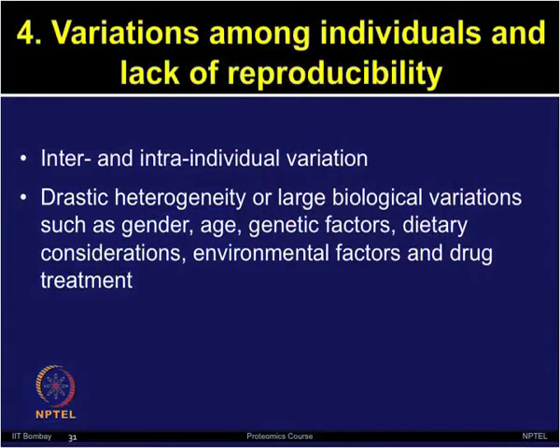So, the drastic heterogeneity or large biological variations such as gender, age, genetic factors, dietary considerations, environmental factors and drug treatments are going to affect the reproducibility of your experiments. So, if you are careful in designing the experiment, one can at least minimize these variations and increase the reproducibility of the proteome analysis.